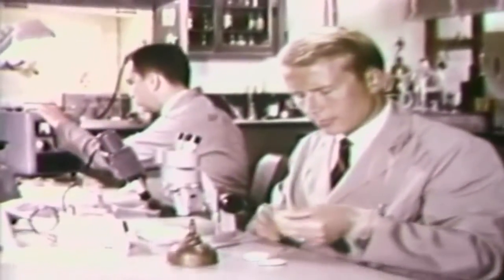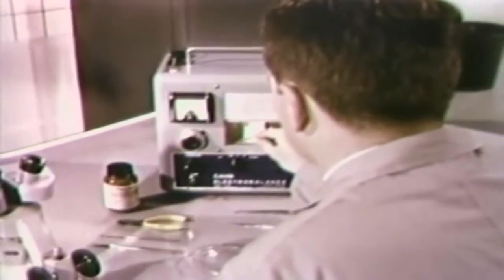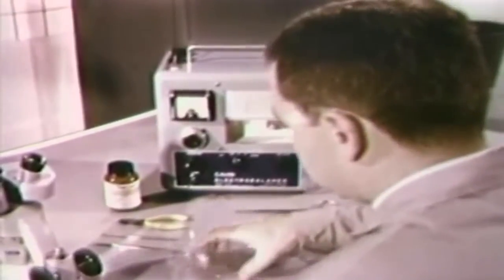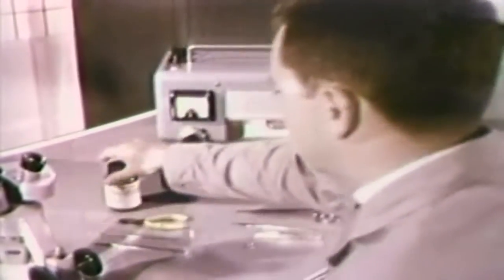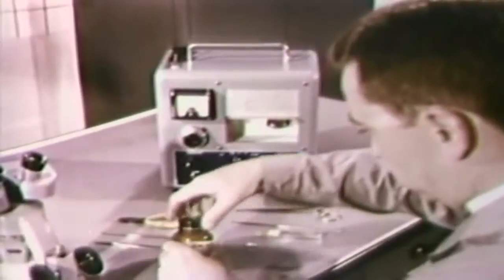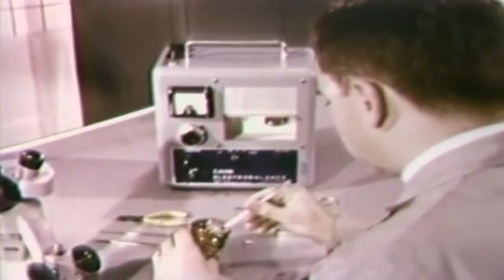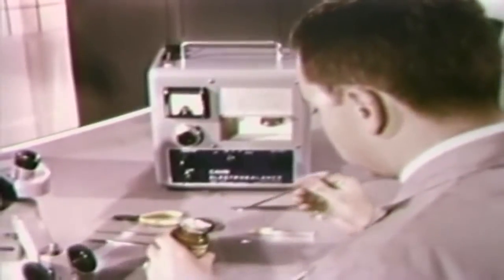A specially trained agent of the FBI weighs a bone sample submitted by a law enforcement agency to be analyzed for its arsenic content. He weighs a reference sample of arsenic as a standard. The samples will be packaged in polyethylene tubes and lowered to the reactor core.